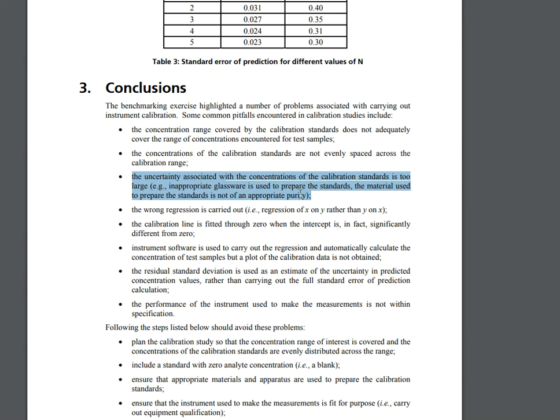Make sure that you pick and judge the preparation properly. You don't want it too small. You don't want it too big. You want workable volumes and measurements that you can utilize in a laboratory easily.